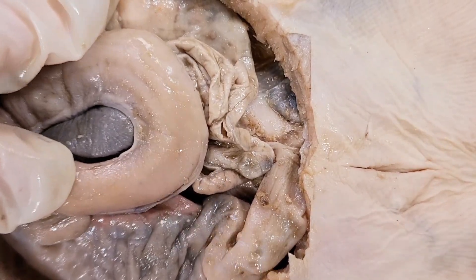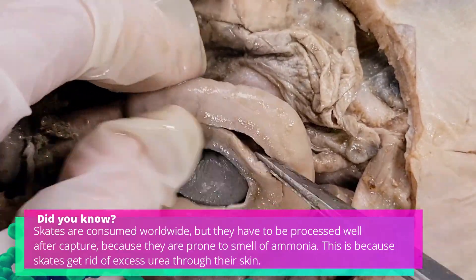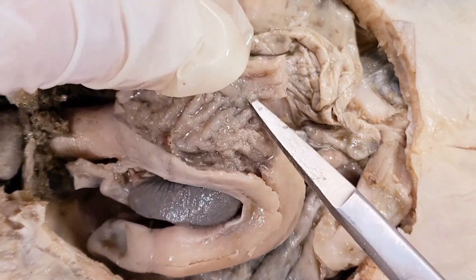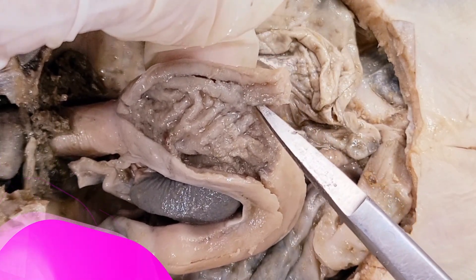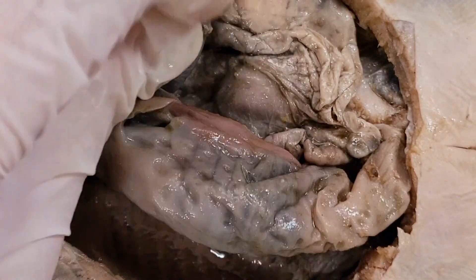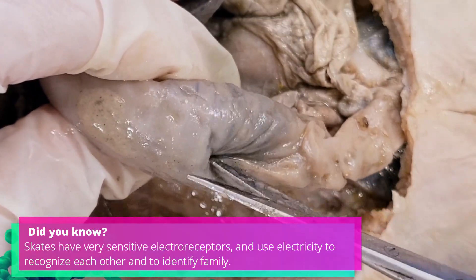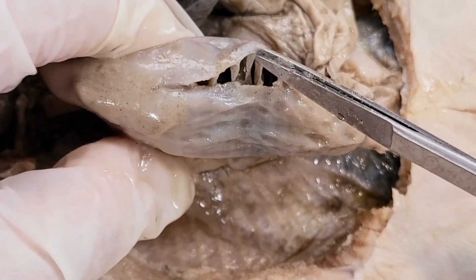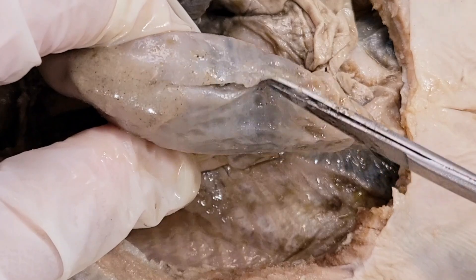Now I'm going to cut into the stomach. You can see these grooves in the walls of the stomach — these folds are called the rugae. They increase the surface area of the stomach and also help the stomach expand, kind of like an accordion. Now I'm going to cut into the intestine. Here you can see the walls of the spiral, and the spiral goes like this — you can see the walls of it here.